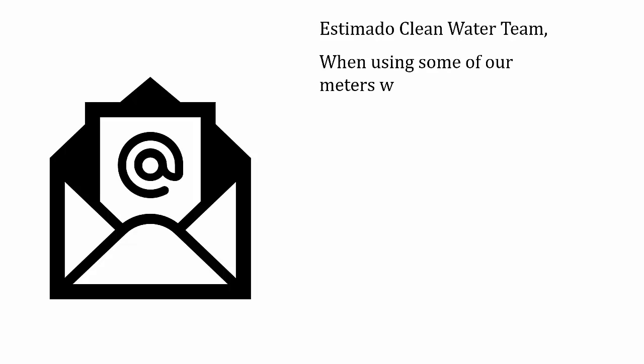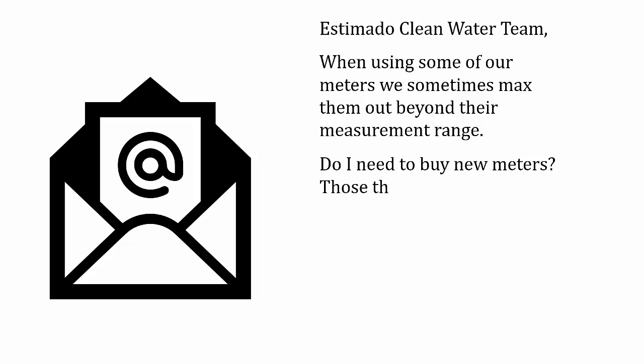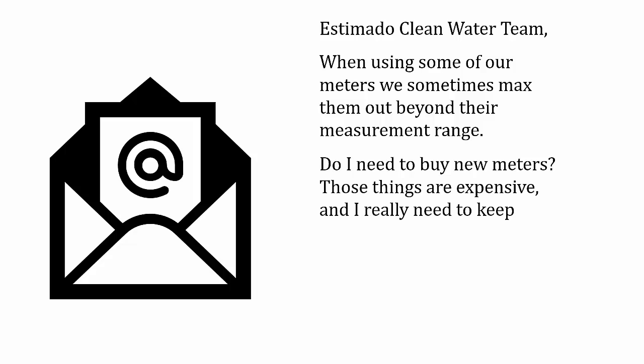Estimado Clean Water Team, when using some of our meters, we sometimes max them out beyond their measurement range. Do I need to buy new meters? Those things are expensive, and I really need to keep the ones that I already have. Gracias. Jose C.